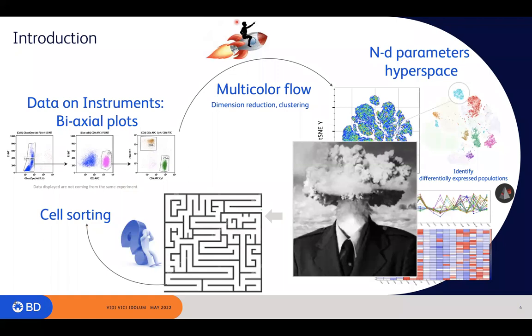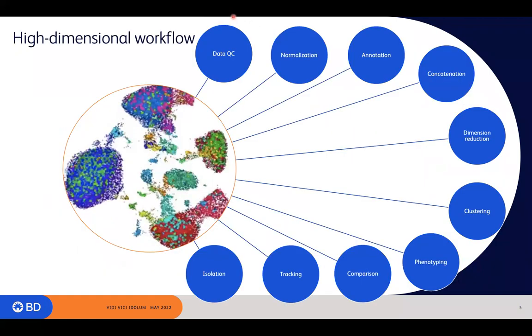Okay, so in order to approach these types of problems, I think it's very important to have a map as to how to approach these, right? So you know which steps come first, and then which steps come next, etc., so that you have a general workflow to have with you while you're on this journey, so to speak.